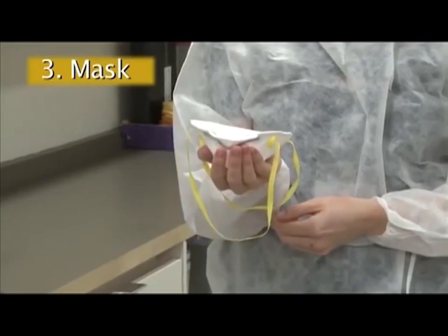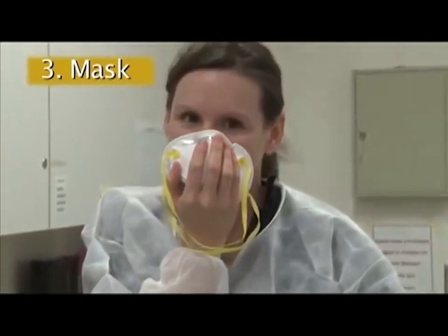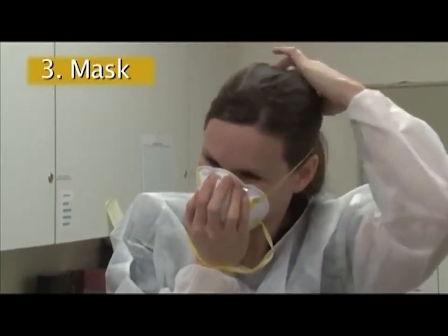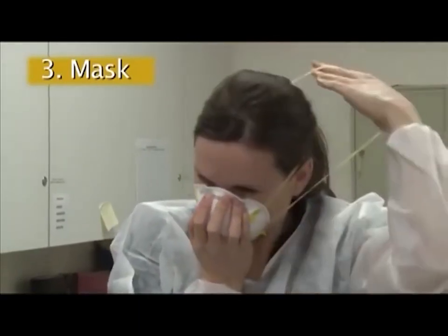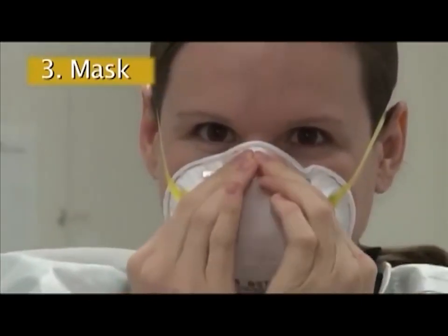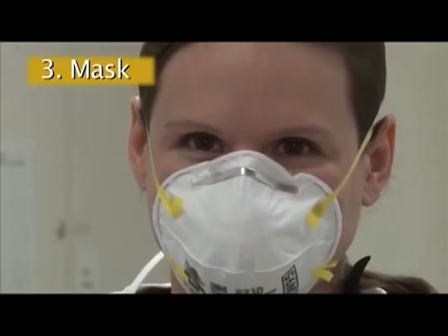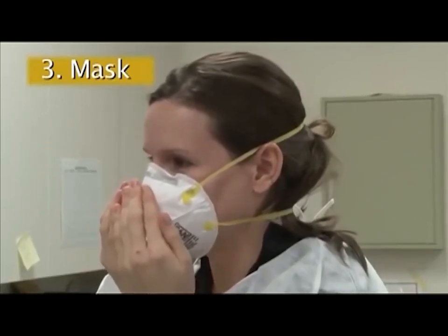For respirators, be sure to use an appropriate size mask as determined by approved fit testing. With clean hands cupping the outside of the mask, place the mask over your nose, mouth, and chin, securing it to your head with ear loops, ties, or with the elastic straps to ensure a snug, secure fit. Place the upper head strap around the back of the head above the ears. Place the lower head strap around the back of the neck below the ears. Do not cross the straps. Position the flexible nose piece over the bridge of your nose, shaping it to fit. Adjust the mask so it is snug to your face and extends below your chin. For respirators, perform a seal check.